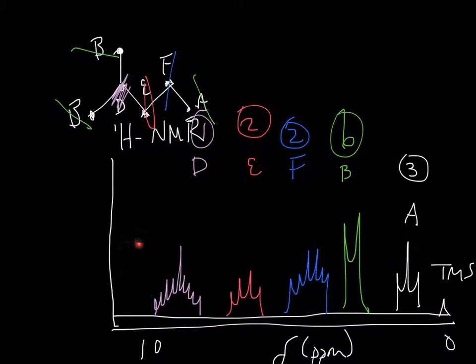Usually carboxylic acids are pretty far down. So I just wanted to give that heads up. Usually when I draw them and you will draw them, we'll put them far downfield just because it makes sense, and many times they really are around 6 or 7. But I just want to let you know, whenever we start doing this in the lab, don't be alarmed if your alcohol peak is at 4, because since it's exchanging so quickly, it doesn't always follow the rule.